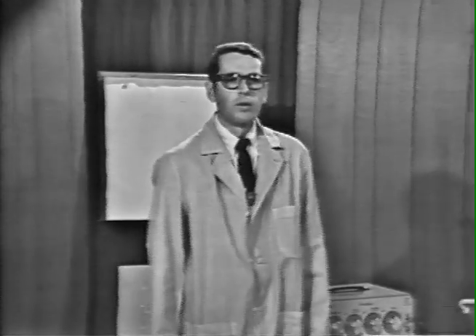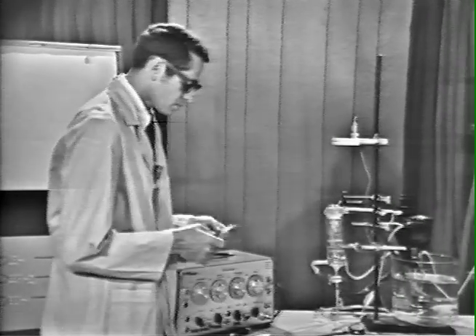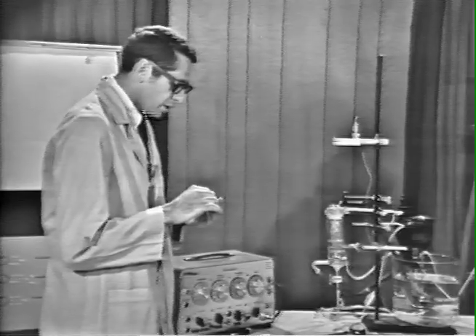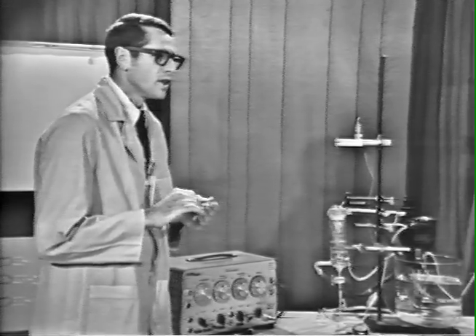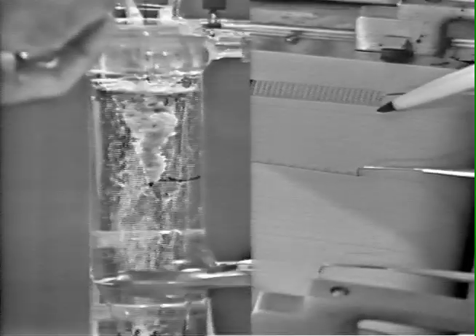We are now going to inject tyramine into the tissue bath, to determine the response to this amine. Remember that this amine acts by displacing catecholamines from the nerve terminals. We're going to give tyramine so that the final concentration is 1 microgram per milliliter in the bath. The tyramine is now in.